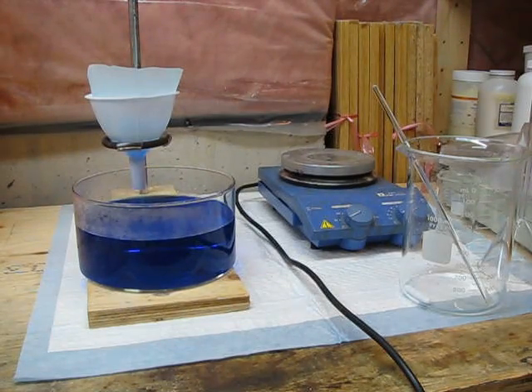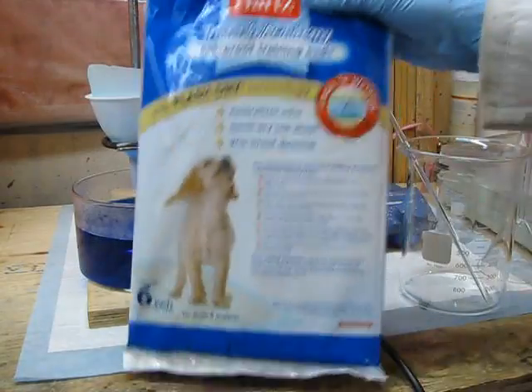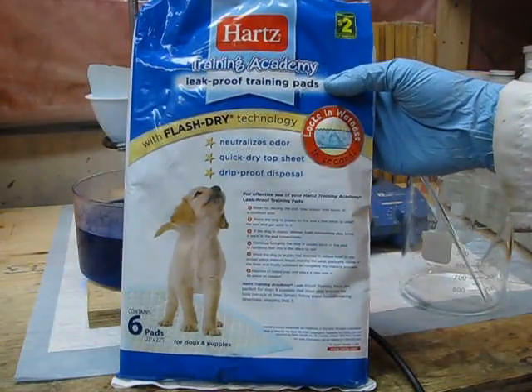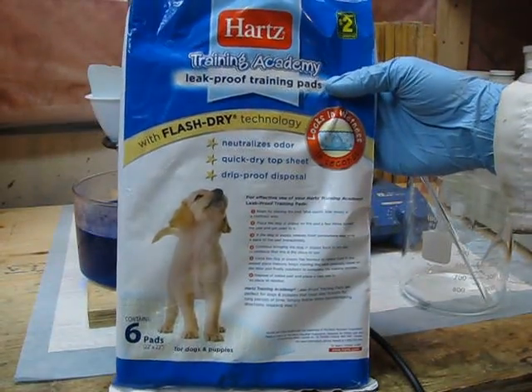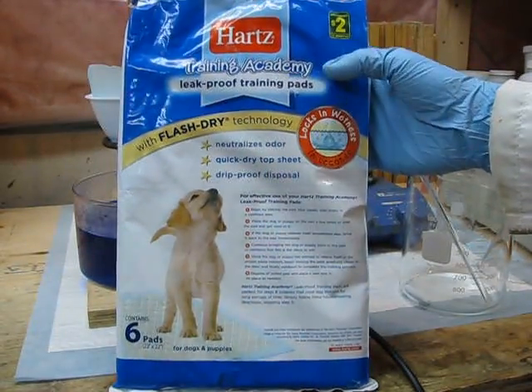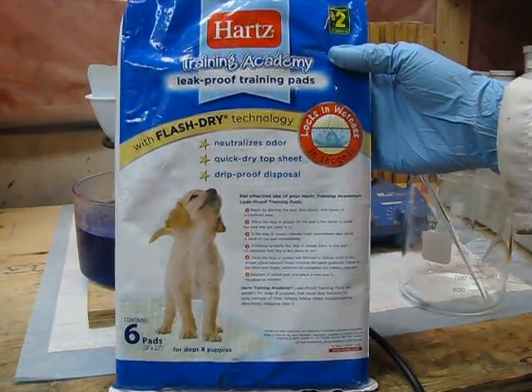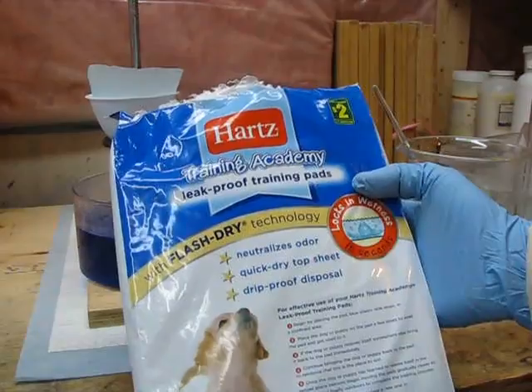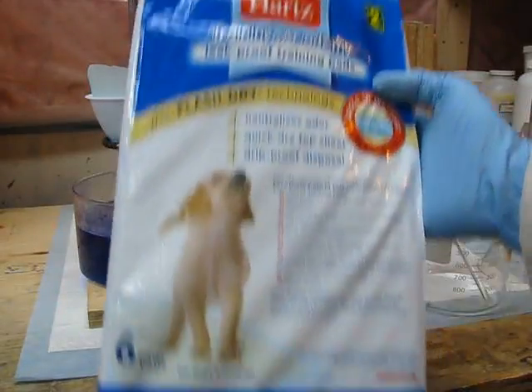Now, you may not have this exact brand wherever you live. I'm in Canada, so there's a chain store called Dollarama. But if you are in the US, there are several other chain stores that you can go to. Otherwise, you can just look at your local pet supply store for pads like these.